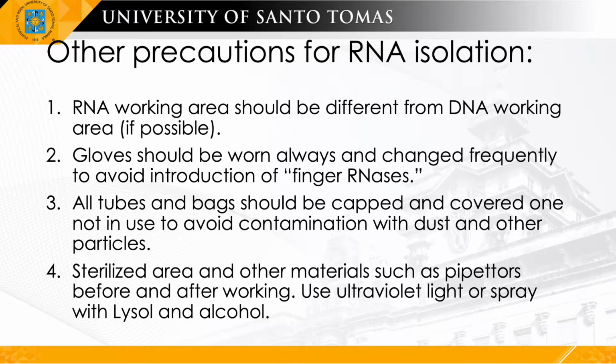Just a reminder, with UV light, when it's on or when it's exposed, you shouldn't be in the same room, no? So that's a no, especially the ones that are sold commercially. Aside from the fact that your eyes may be damaged, ultraviolet light produces what we call free radicals that may damage cellular integrity and may actually be cancerous in the long run.